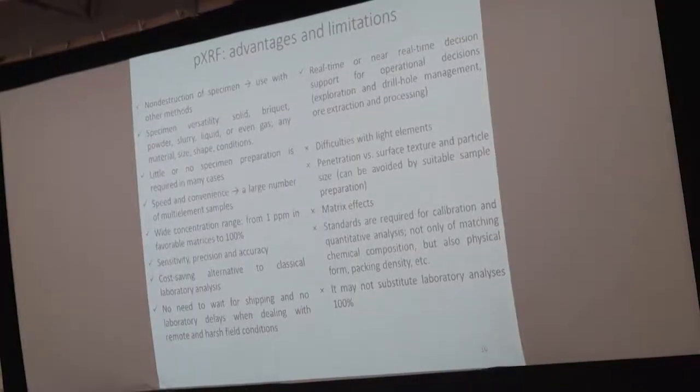Let's sum up the advantages, and I wouldn't call them disadvantages, but limitations of PXRF. It's a non-destructive method to analyze various samples from solids to liquids in versatile size, shape, and conditions. It requires little to no sample preparation. It is fast, convenient, and under certain conditions, sensitive, precise, and accurate. Unlike most element analysis techniques, it allows a wide concentration range detection, from 1 ppm to 100%.